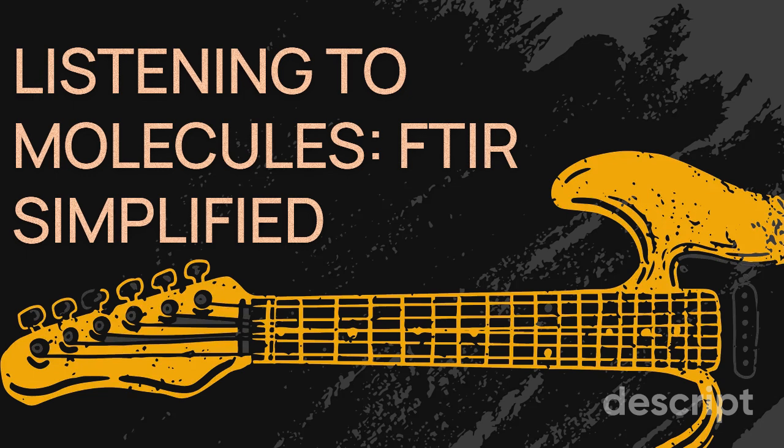We've explored how FTIR can reveal both the dynamic and static aspects of protein structure. Right. But I want to zoom out a bit and talk about the bigger picture. How has FTIR spectroscopy revolutionized our understanding of proteins and their role in biology? FTIR has been a game changer in protein science. It has provided us with a window into the molecular world that simply wasn't available before. So we're talking about a paradigm shift in how we study these essential molecules.